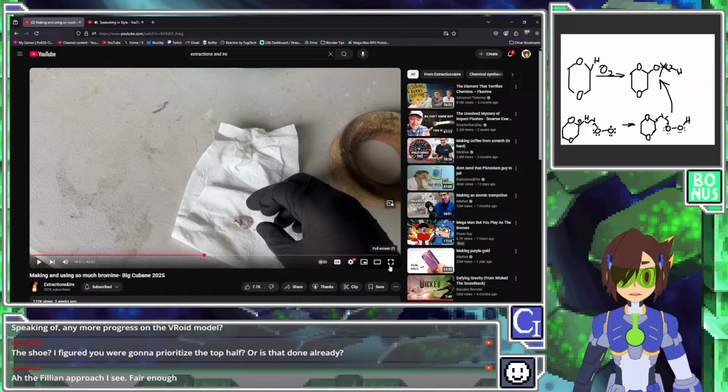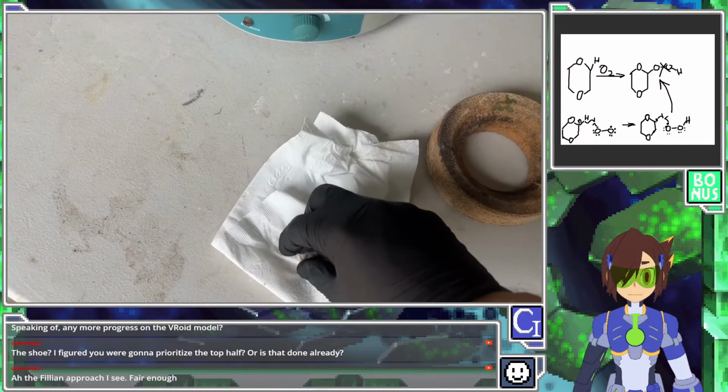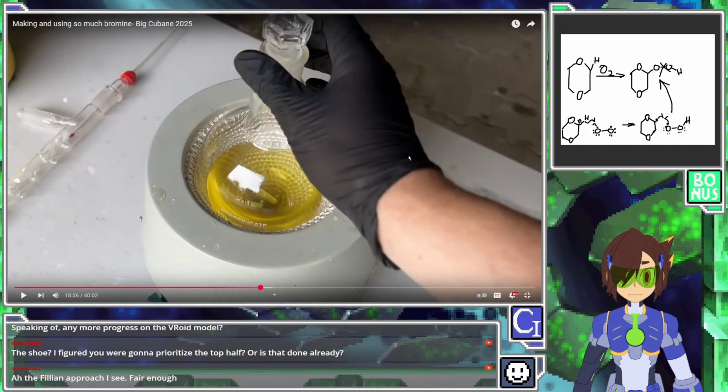But anyway, he's going to go in this with drying it with sodium, and I'm not necessarily sure what the drying part is important for, because that's not going to get rid of the organic peroxides, but let's hear him out. Let's let the man cook. And the sodium should destroy the peroxides, and then I'll just feel safer about this. I'm not going to compromise on safety. Well, I mean, I guess so.